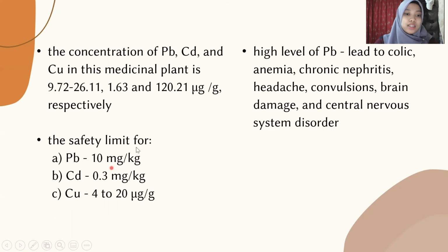It has exceeded the safety limit that has been given by the World Health Organization, which is also known as WHO. However, the high level of Pb contained in this herbal drug might lead to colic, anemia, chronic nephritis, headache, and so on.